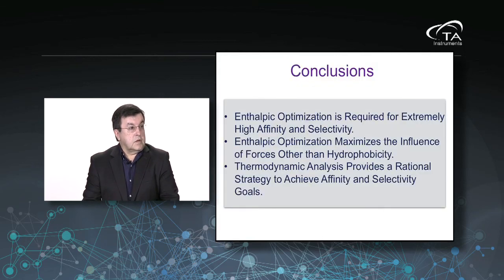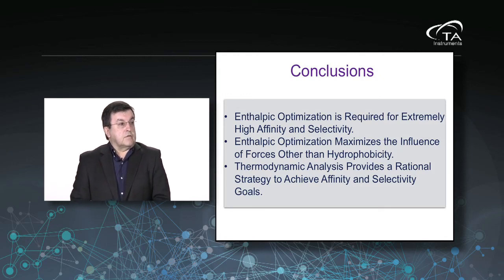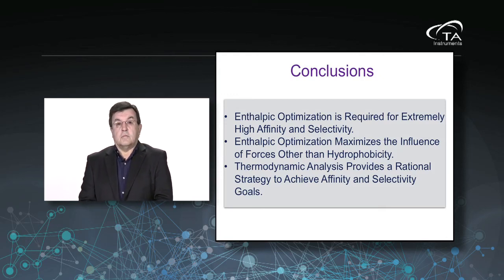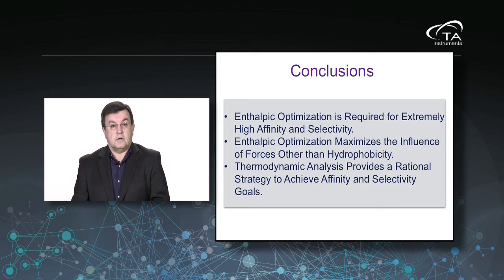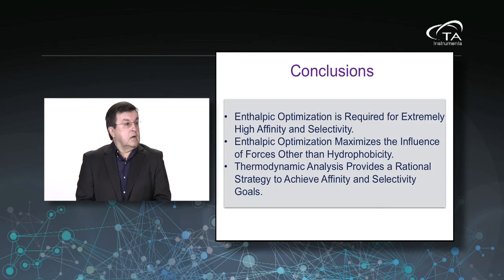So with that, I can conclude that enthalpic optimization is required for extremely high affinity and selectivity. Enthalpic optimization maximizes the influences of forces other than hydrophobicity and therefore improve LIP-E. And thermodynamic analysis provides a rational strategy to achieve affinity and selectivity goals.